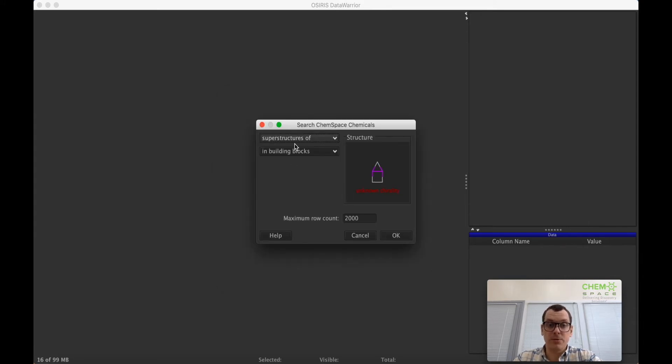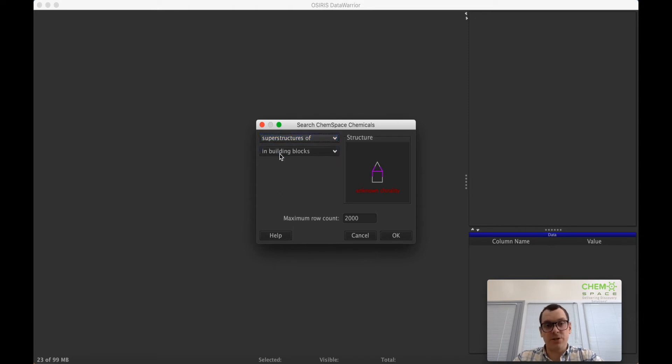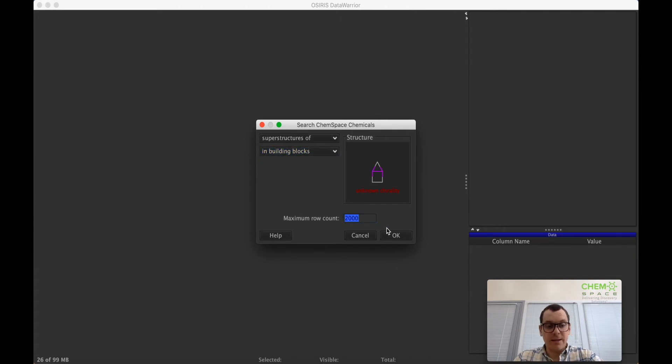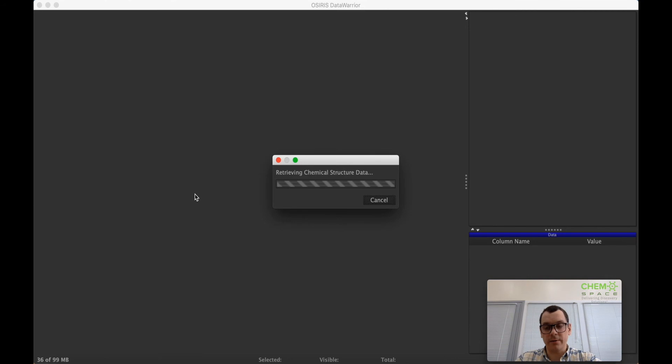And then search either by substructure or by similarity in the largest collection of building blocks and screening compounds. You can select the number of molecules you want to have retrieved after the search and just hit the OK button.